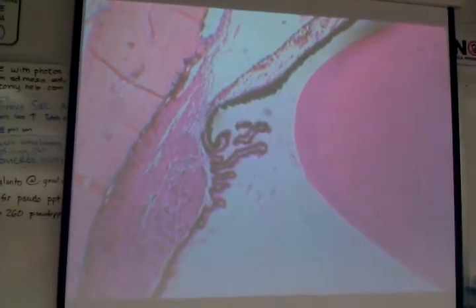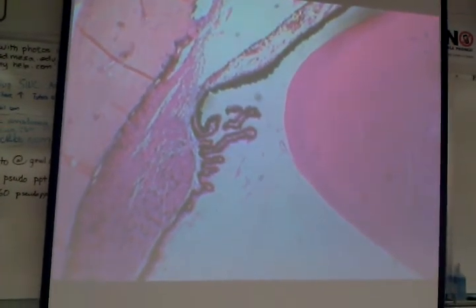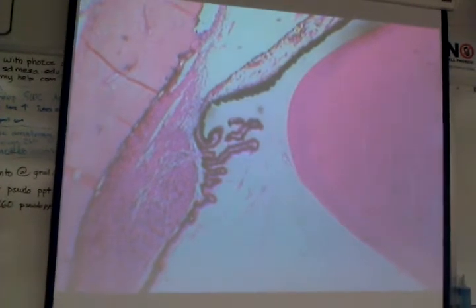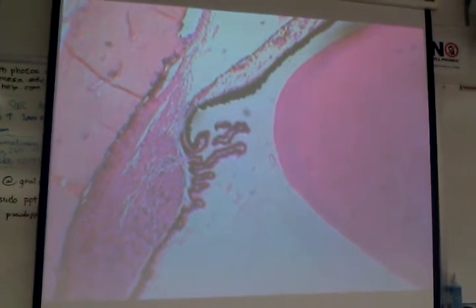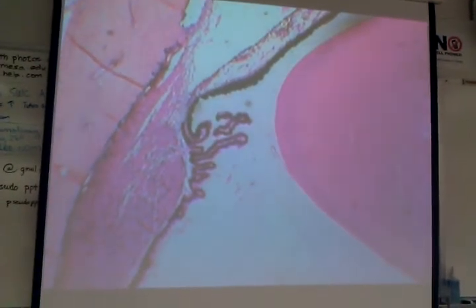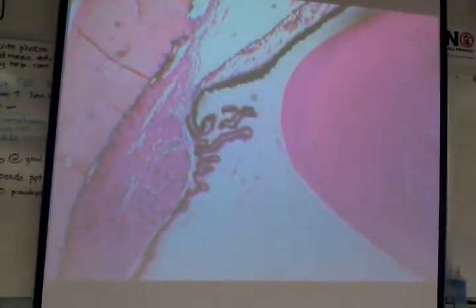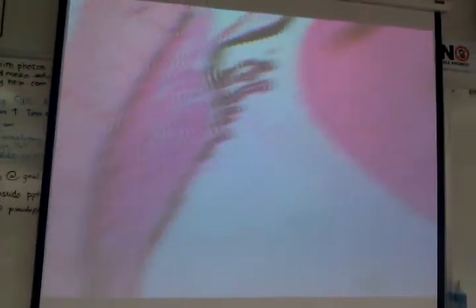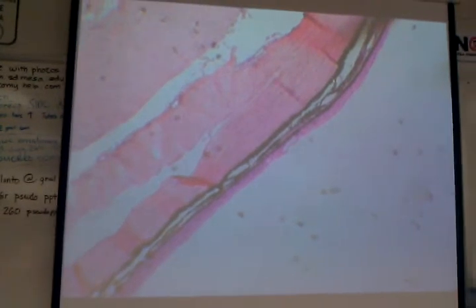This is the ciliary body. And these little guys kind of right here, they're actually called the ciliary processes, and what's attached to them are the little ligaments that you can't see. So iris, ciliary body. Remember the ciliary body is the anterior projection of what's called the vascular tunic. So let's look at this under higher magnification.